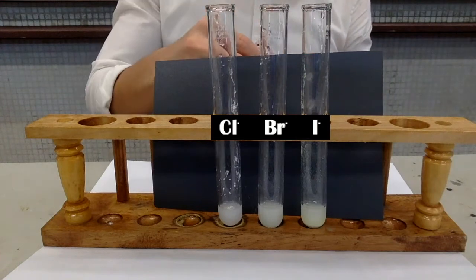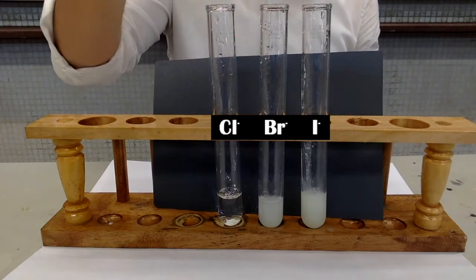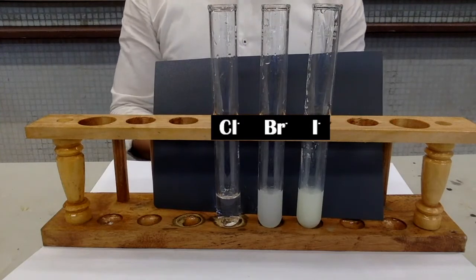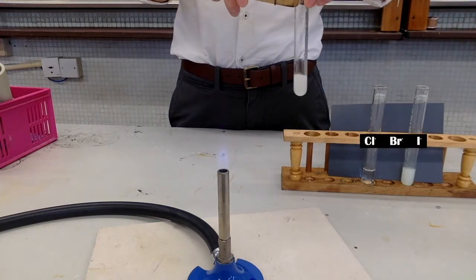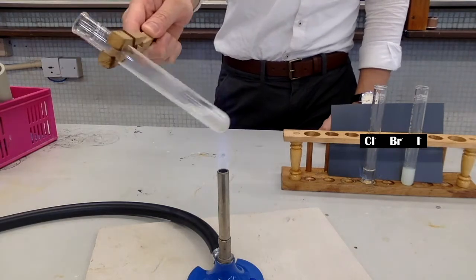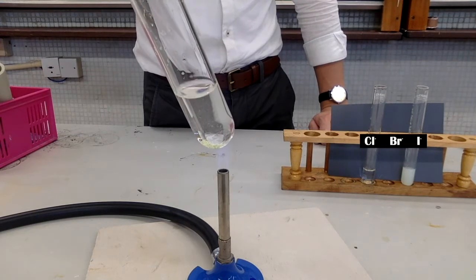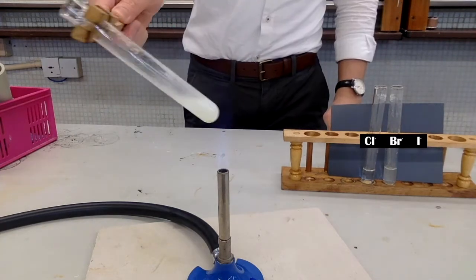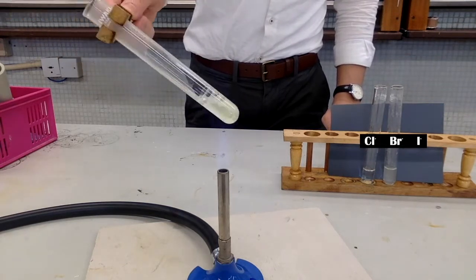Therefore, ammonia solution was added into the sample to further confirm the identity of the ions. Upon adding ammonia solution, the white precipitate with chloride redissolved. The creamy precipitate with bromide redissolved upon heating. Even with heating, the pale yellow precipitate with iodide remained undissolved.